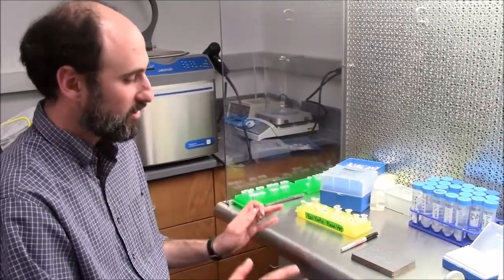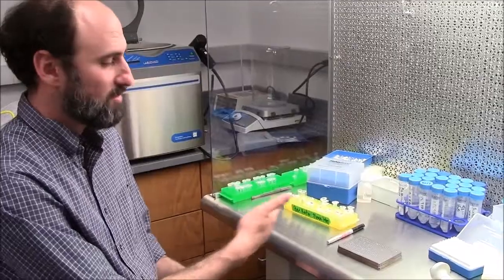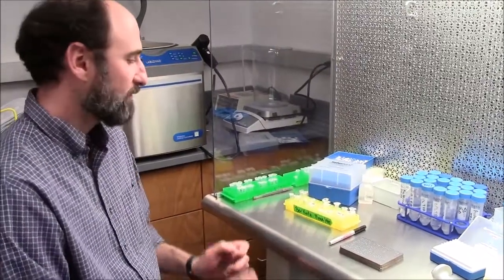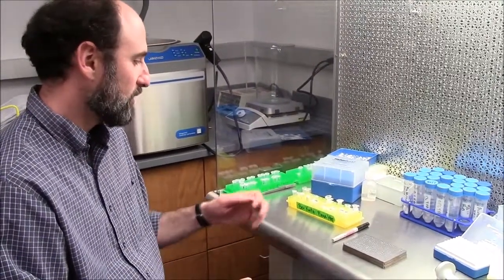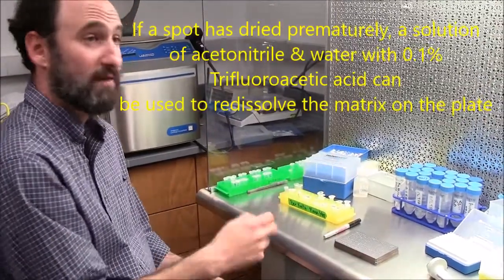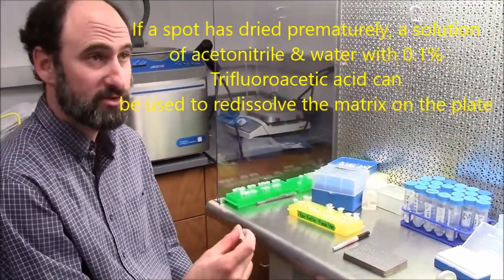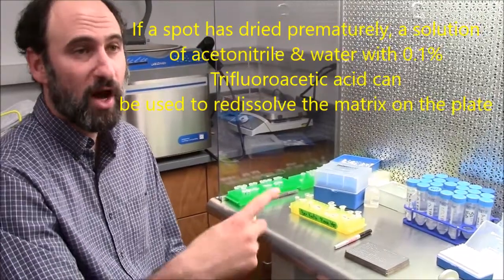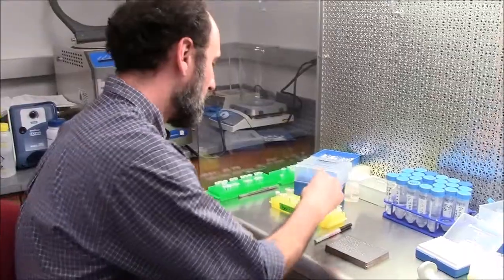Try to keep things very uniform. I'll try to do maybe five spots in a row. If they ever look like you're getting differential drying, you can always use a solution of 50-50, 0.1% TFA and acetonitrile, the same solution the matrix is dissolved in, and just recrystallize your spot. And that will get them all redry back exactly how they're supposed to be.